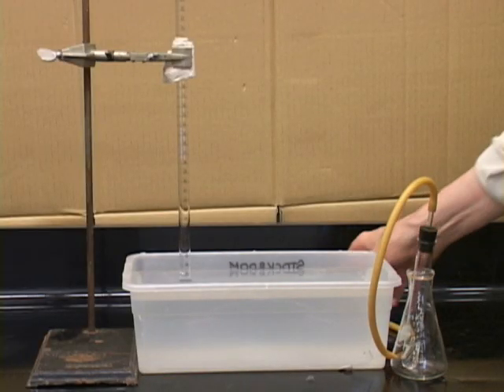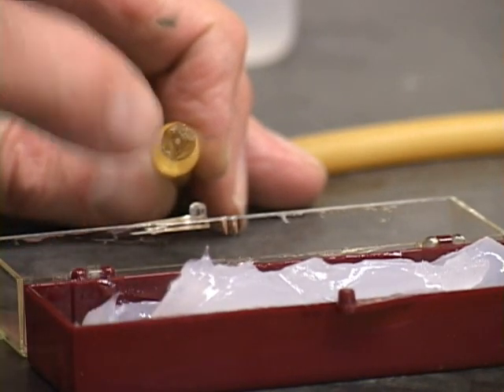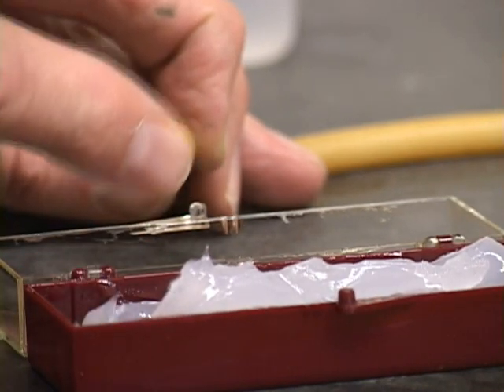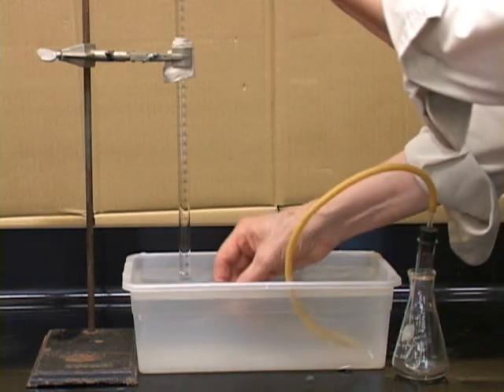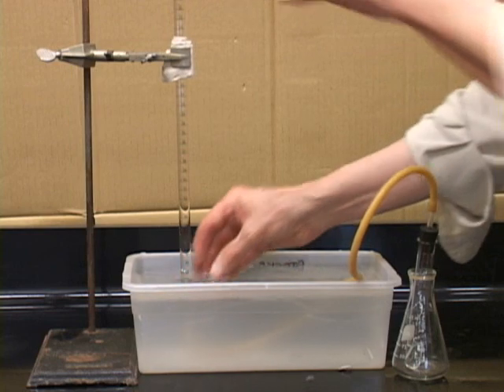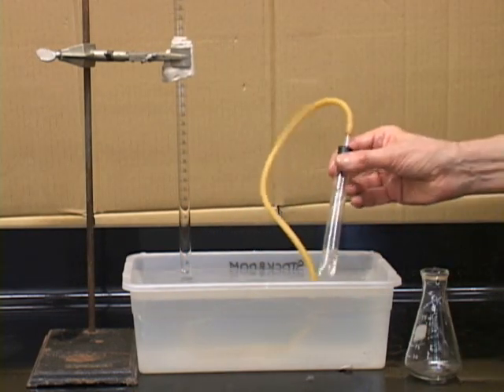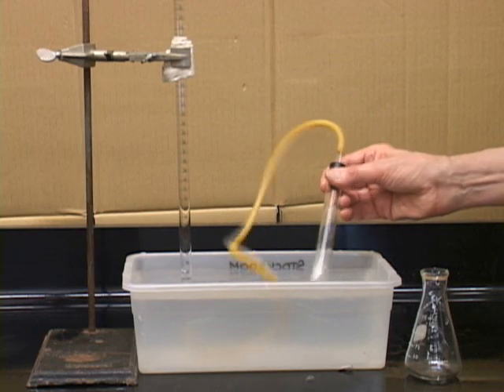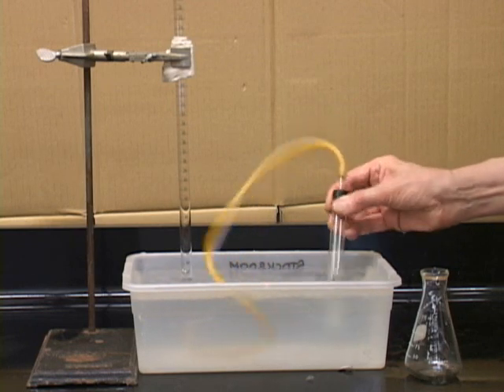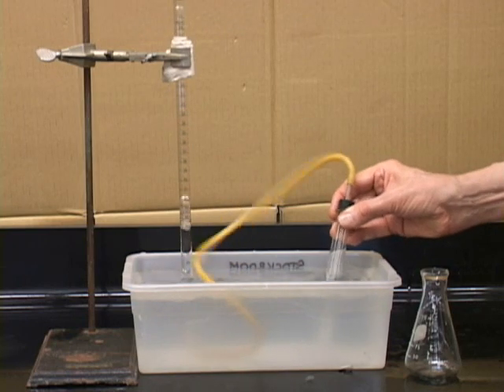To start the reaction, cover the tip of the gas inlet tube with a thin film of grease. Then insert it in the bottom of the gas burette. Then mix and sink the boat in the reaction tube. Now keep this tube in the water bath to maintain a constant temperature. And there she goes.